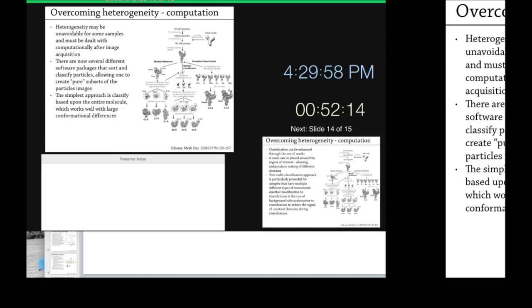The next stage, with 3D classification, they throw away about 2/3 of their data, so they end up with only about 140,000 particles. What this means is not always clear. In some cases it's because the particles are damaged during purification. In a very multi-component complex such as this, that may mean that you're getting rid of particles that are missing domains, which may or may not help you in your reconstruction when you go through and do this masking afterwards.